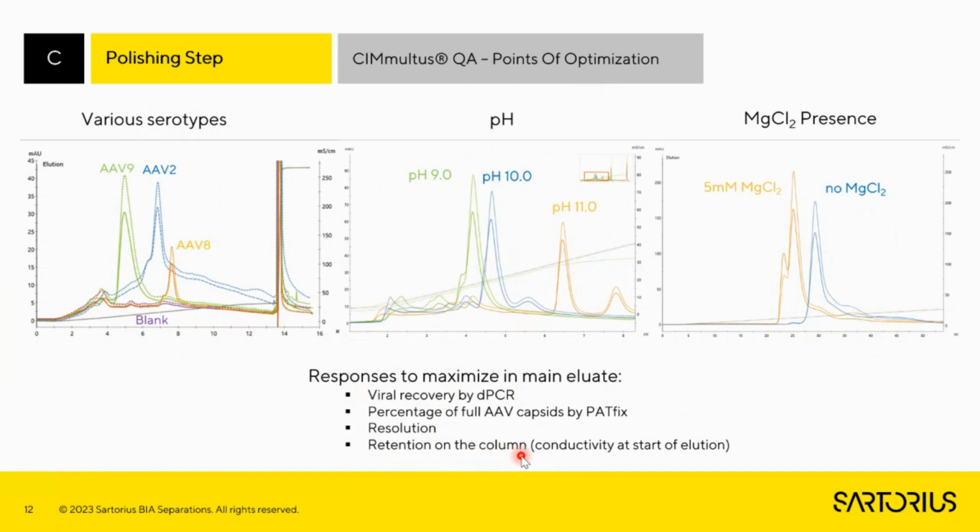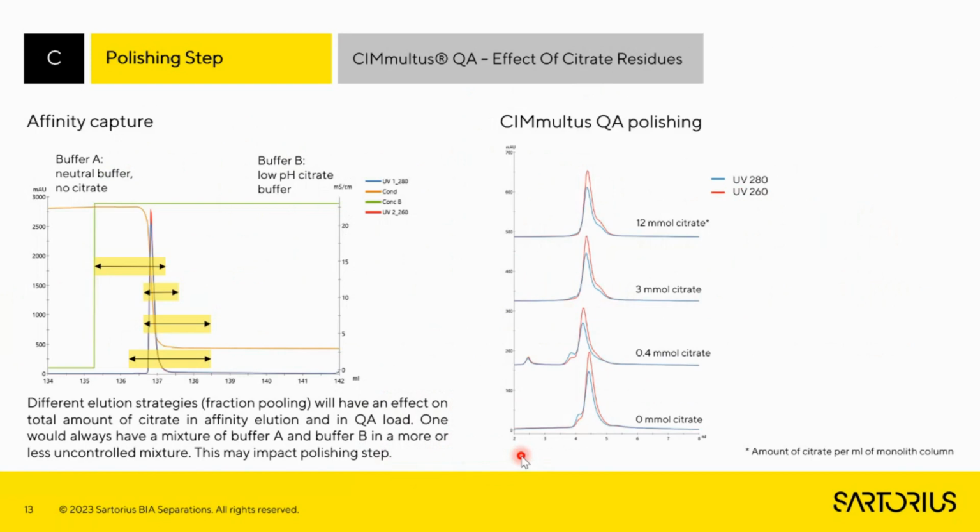So the idea is that you want it to elute the latest possible. That means that if you go with a dilution approach, this could mean a difference from 10-fold to 50-fold dilution, and especially in manufacturing, in the GMP area, you don't want to increase your volume from one step to another, so it should be reduced. Therefore, having later elutions means less dilution of your process.